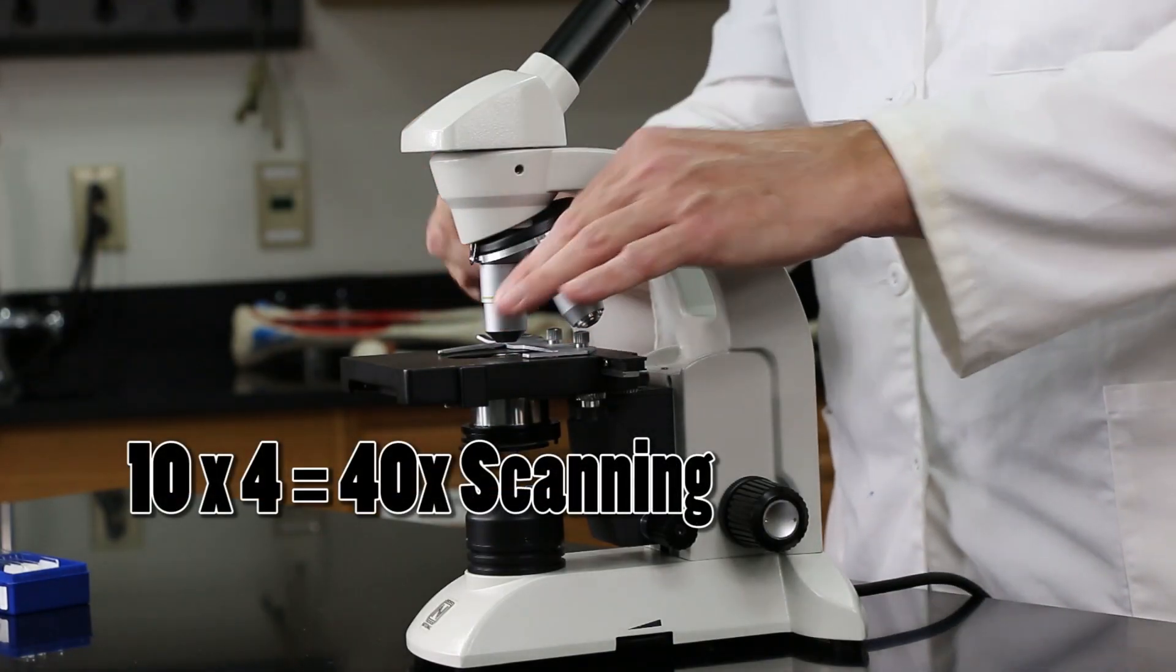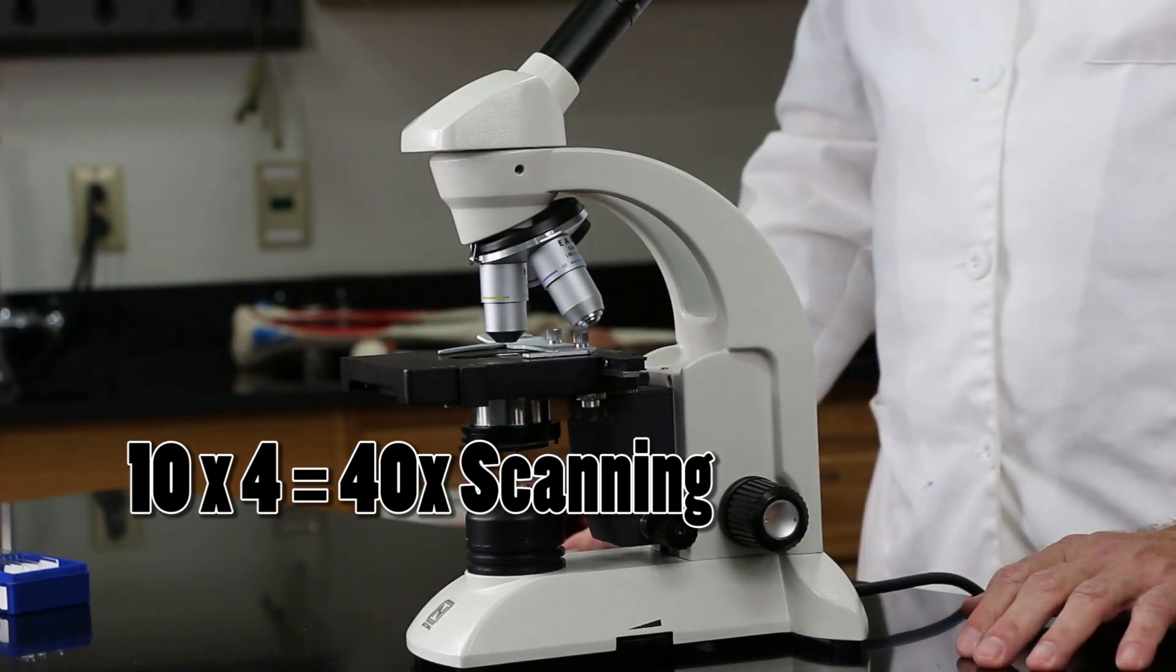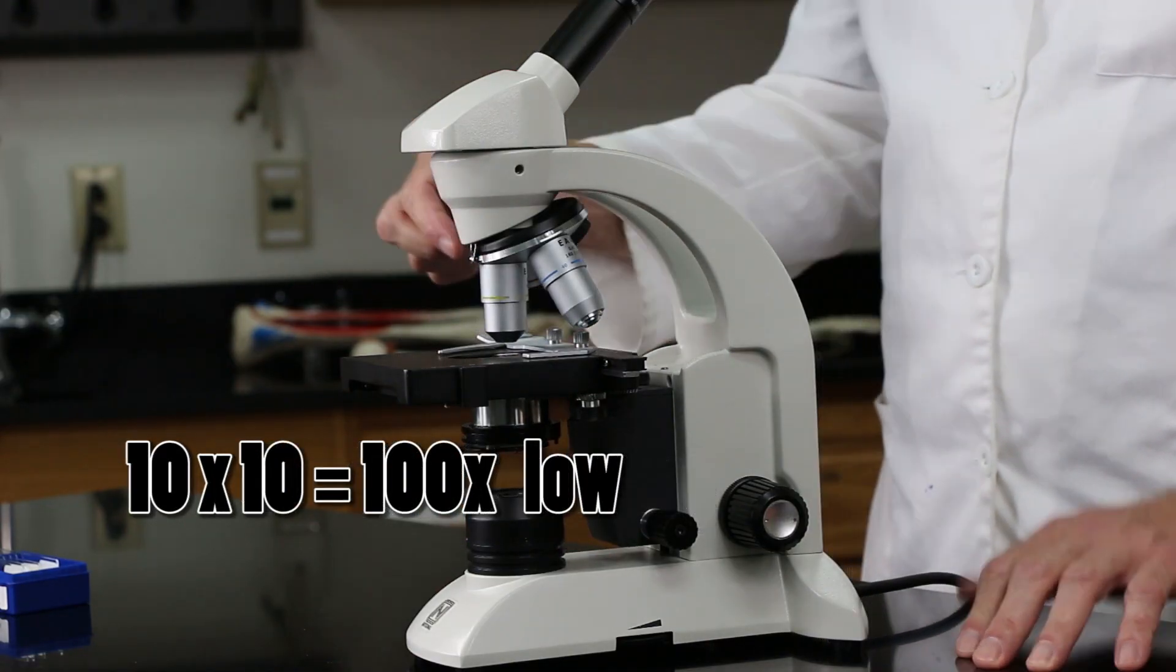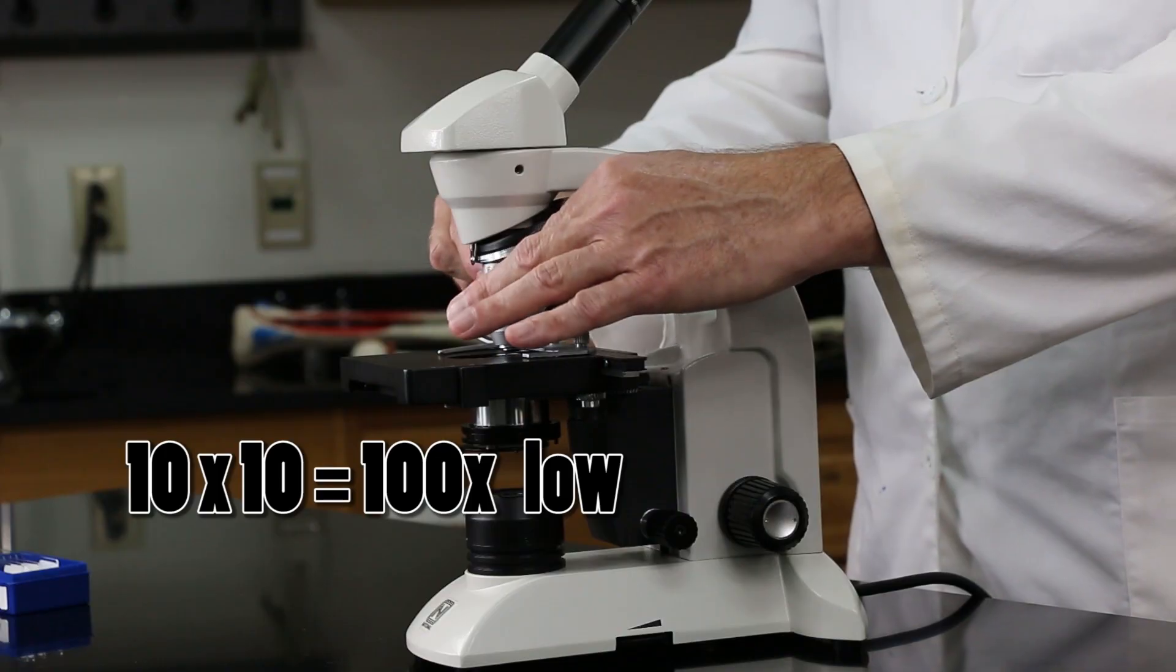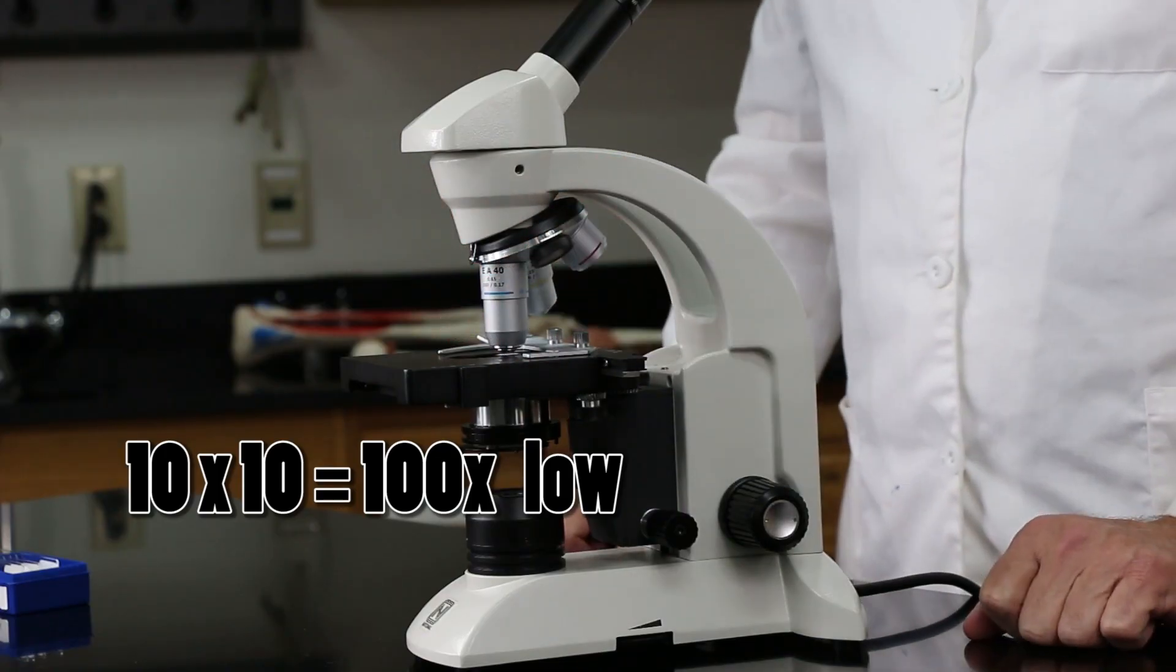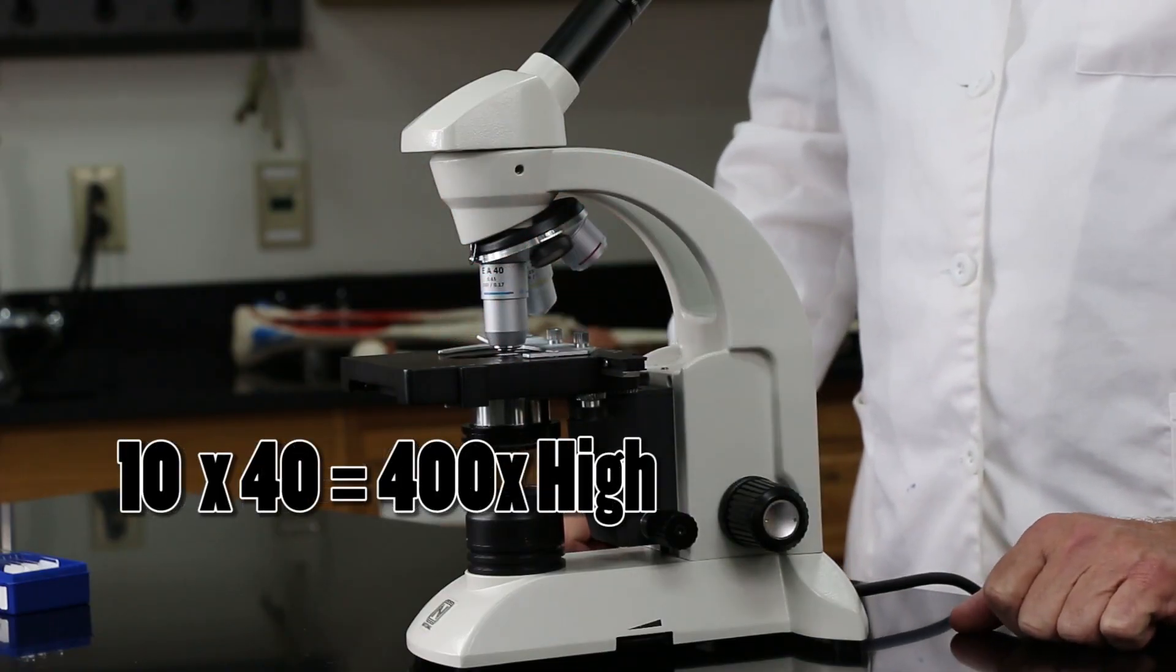If I turn it to the low power lens, that's 10x10, which is 100. And if I turn it to the high power lens, that is 10x40, which is 400.